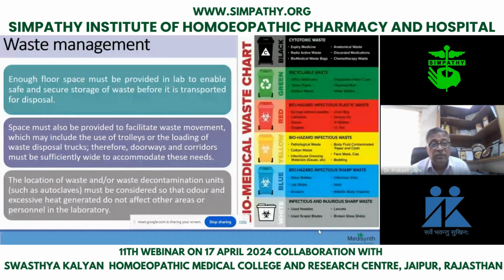Now, waste management. Waste management is very important. Enough floor space is needed. Whatever waste is there, how you dispose of it. Today, look, our PM is also saying so much about Swachh Bharat. So it is not that you can throw anything anywhere. You go to the airport, the wet material is kept separately. There are separate places to throw the wet, dry food and all that.